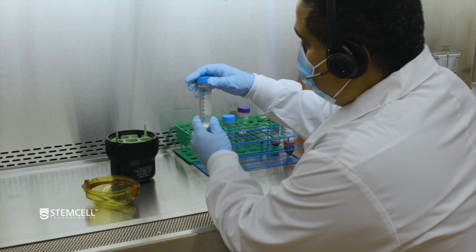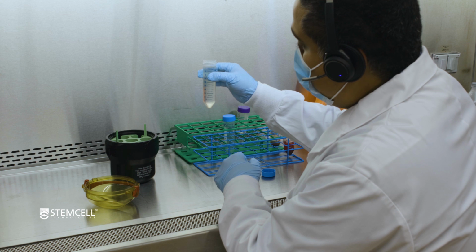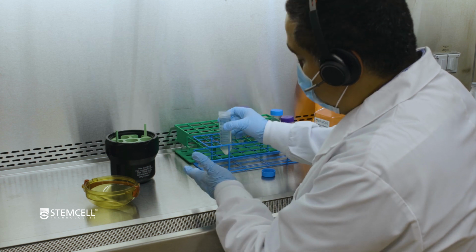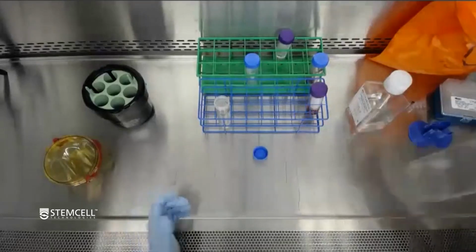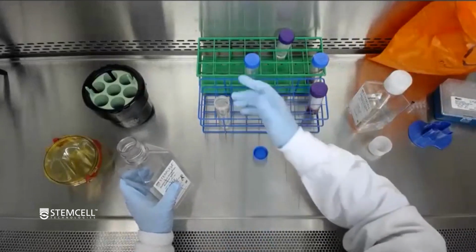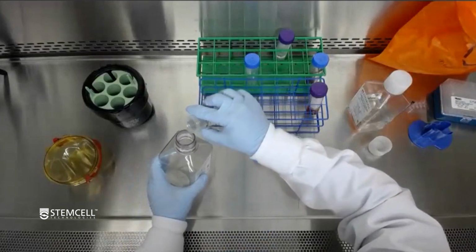So at this point, your options are to either decant by pouring or to simply aspirate out. Most customers, because they're interested in getting through this quickly, will just decant. Just be aware that if you are very recovery oriented, you could elect to just pipette off carefully.